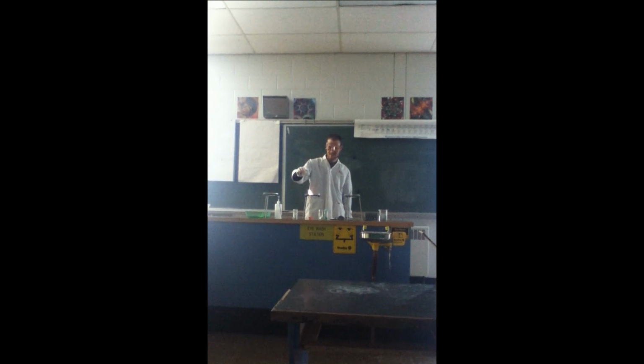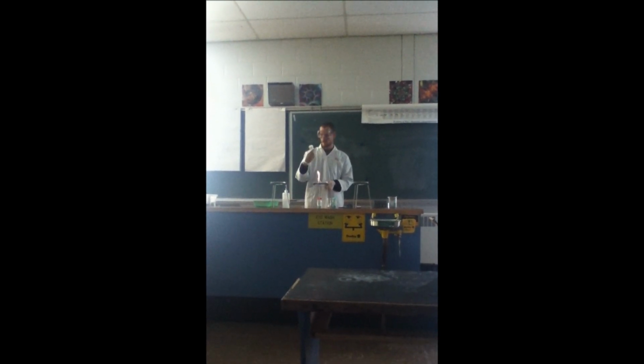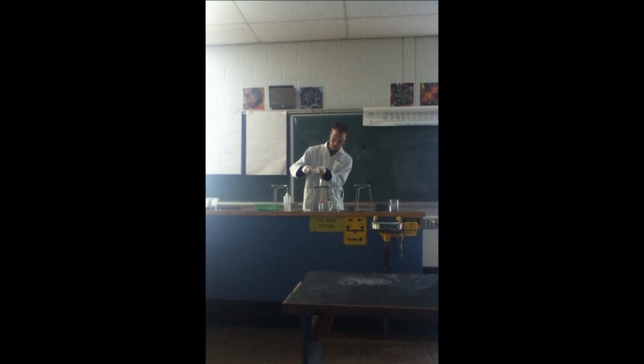That's a good one. Look at that. That's a good one. Okay, I like that one. It's a very fine powder, so when it falls in there, it dissolves nice and quickly, and then you get lots of color, intense and quick. Okay. Finally, we have calcium chloride. Okay, we're going to try out some calcium chloride and see what color we get.